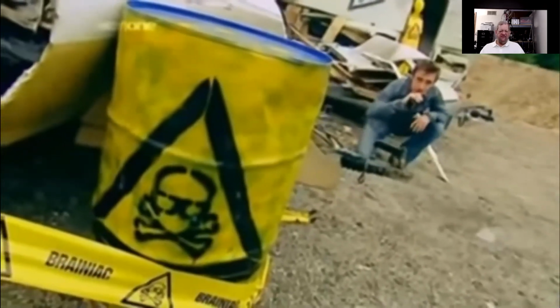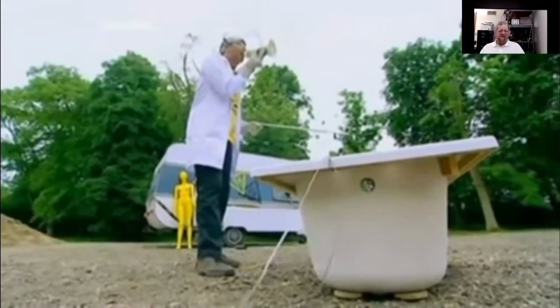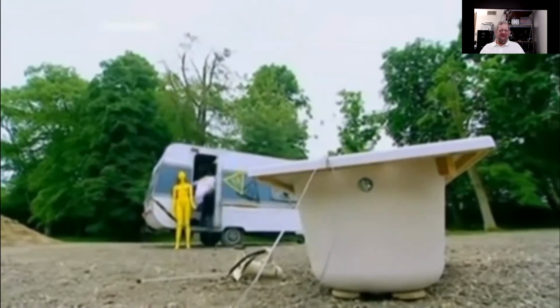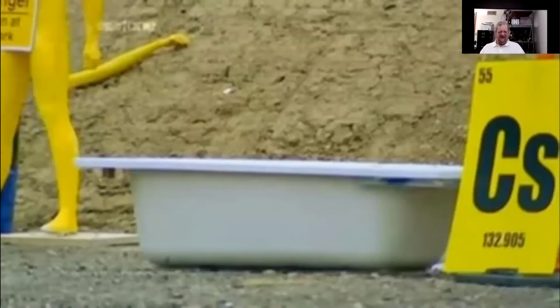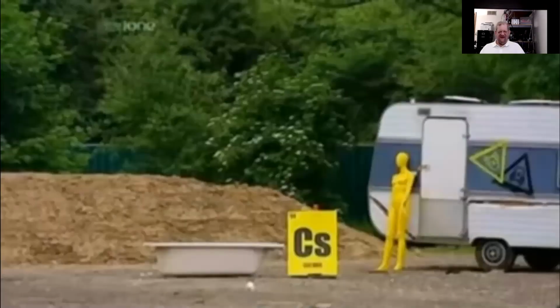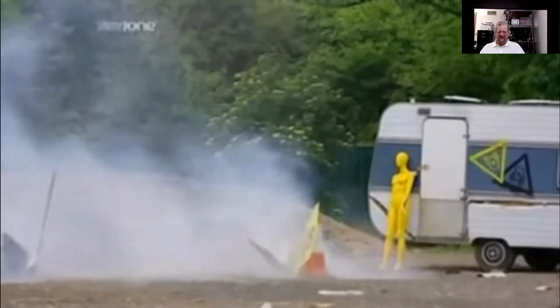Okay, John, go for it. Warning, warning, warning, extreme danger, clear the area. That's our cesium sinks in the water, the rapid generation of hydrogen gas should produce quite an explosion. And it does.